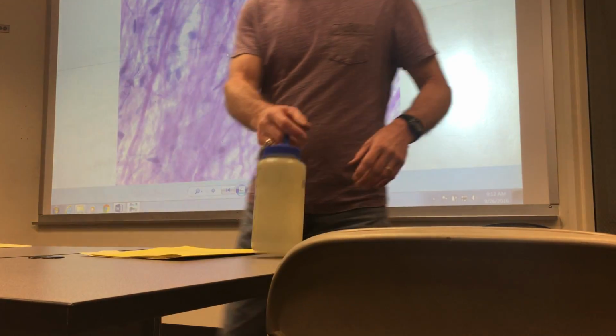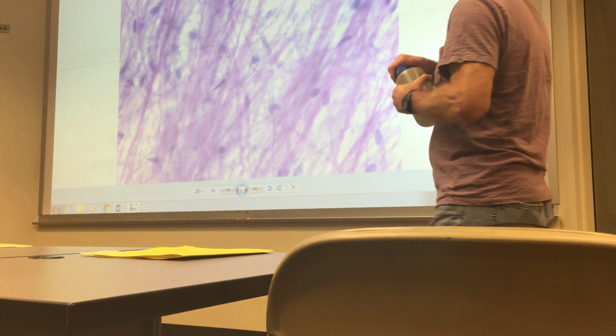This, of course, is classic loose connective tissue. The source here, although it's probably not on the slide, is superficial fascia. That, of course, is the connective tissue that holds your skin to your muscle. If you've ever skinned an animal, whether you hunt and skinned a deer in the field, or you're in the kitchen taking the skin off a chicken breast, that white gooey material that's holding the skin to the muscle, that's what this is.